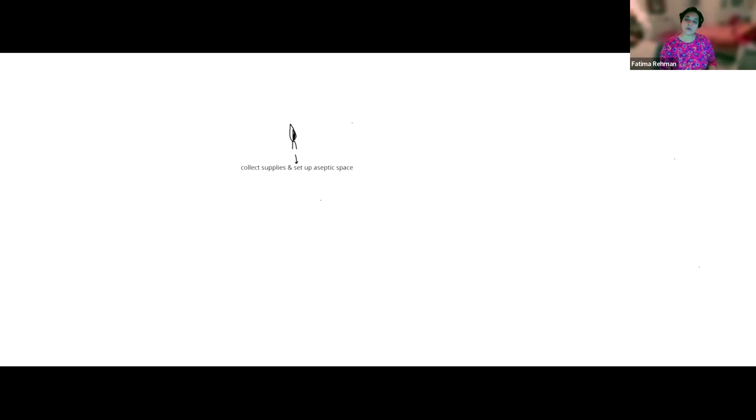What are you checking confluency for? You never got the cells. And do you really want to get your cells yet? Because remember, you're on a timer once the cells come out. If you remember last time, we had a lot of issues with infection, and one of the reasons was that they were staying out too long. Typically you want to keep them out as little as possible, right? Technically you can do the actual procedure with the cells in like 5 minutes, if that. So you don't want to take them out yet.